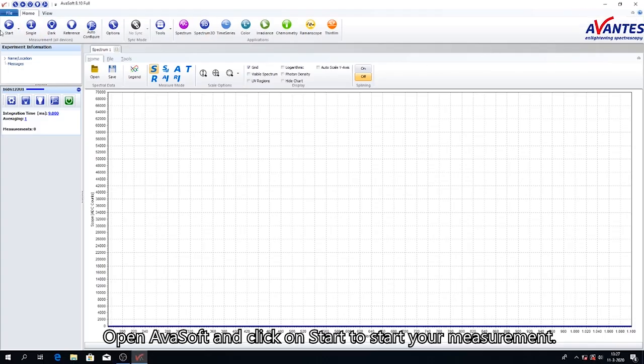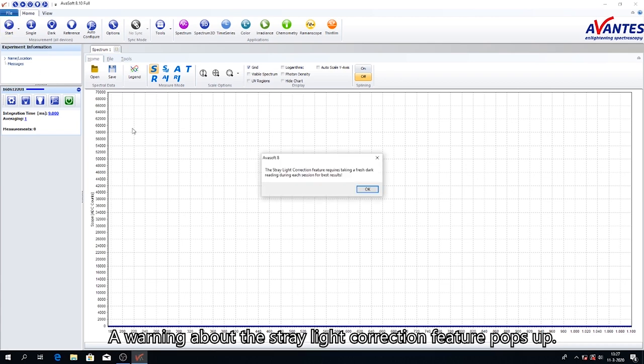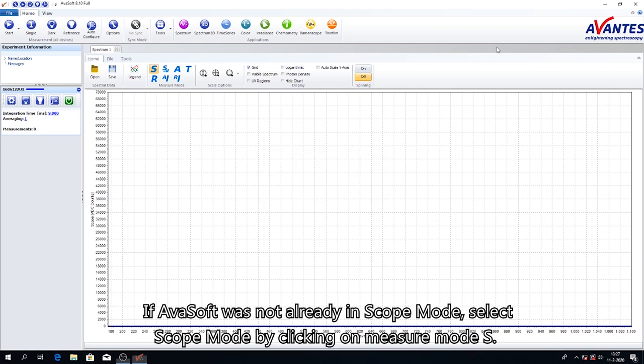Open Avasoft and click on Start to start your measurement. A warning about the stray light correction feature pops up. We will not discuss this feature in this video, but it has no influence on our measurement results. If Avasoft was not already in scope mode, select scope mode by clicking on measure mode S.